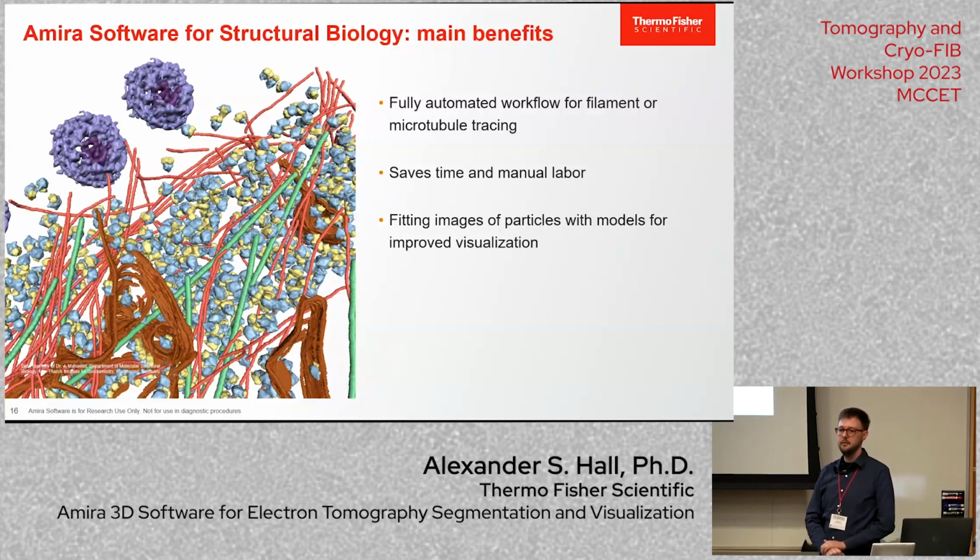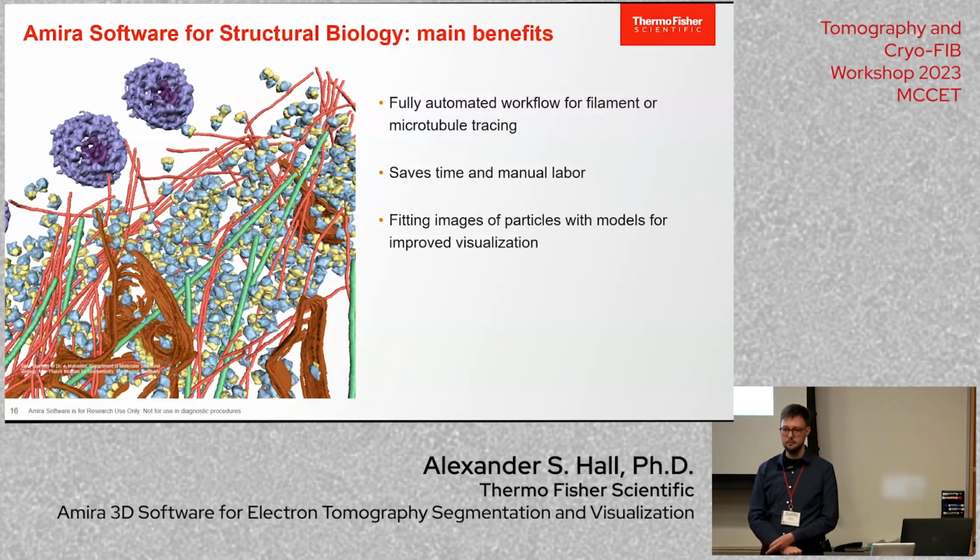Hi, thanks. Very interesting. I'm just curious, following up from the previous question, does Amira come with preset models for a microtubule, mitochondria, Golgi, whatever that should be in mammalian cells, pretty standard? Is that something that you have? Yeah, that's a good question. That's the vision for sure.